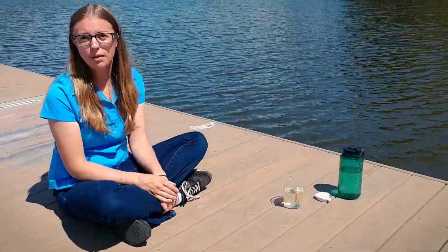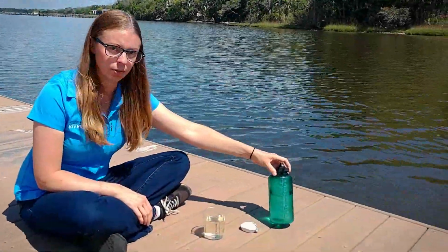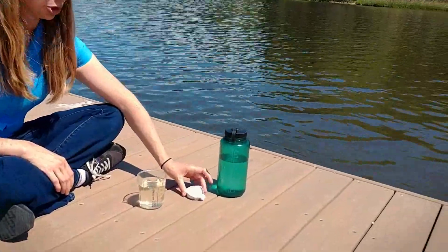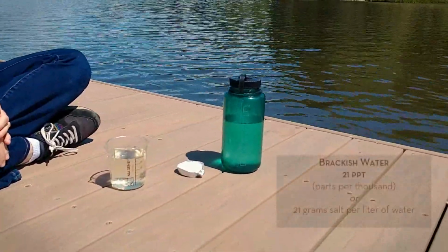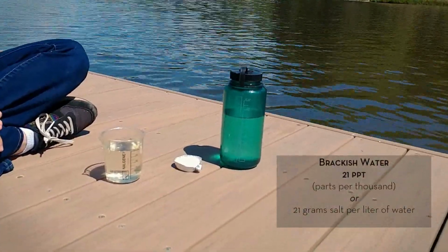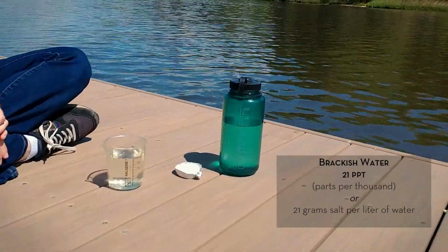The refractometer measured the salinity at 21 ppt. Does that sound salty? To show this visually, I have my 1 liter water bottle and 21 grams of salt measured out. So what kind of water do we have here at JU? We have brackish water as it falls between 0 ppt and 35 ppt.